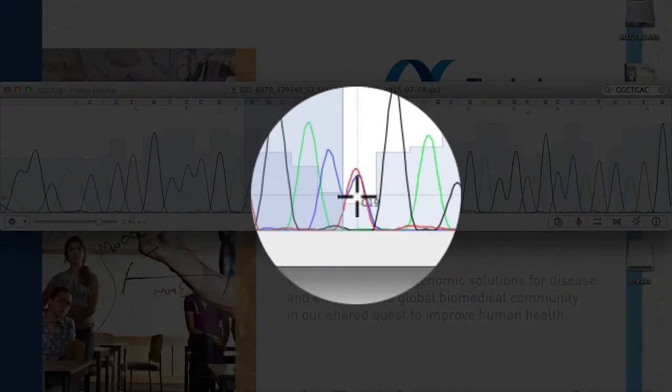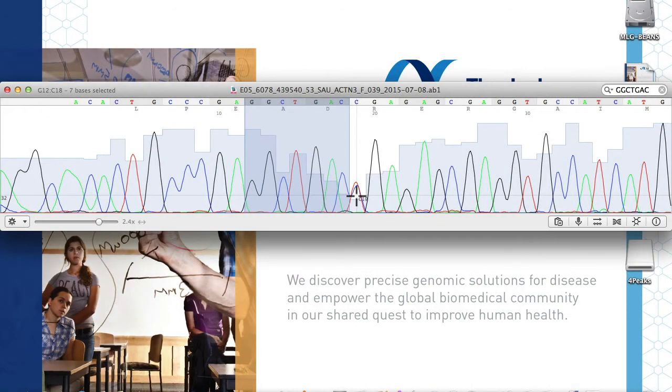The quality bar in this location indicates low quality. However, we can simply interpret this as a heterozygous locus containing two calls of equal strength. This individual received a C from one parent and a T from the other. Using the IUPAC nucleotide codes, we will call this a Y, meaning a C or a T, and save the file.